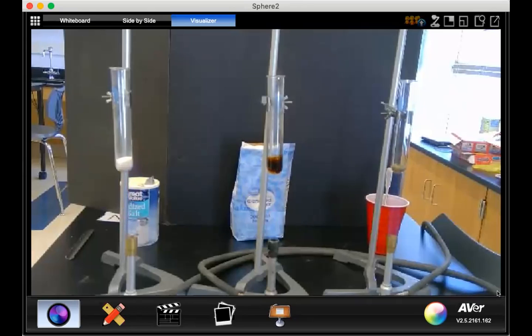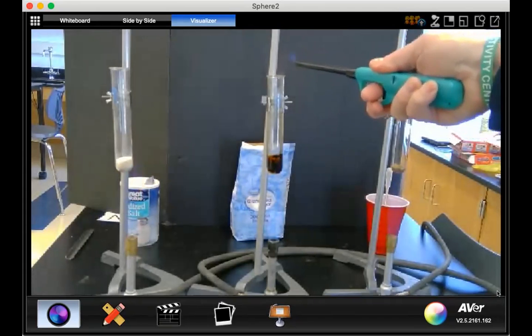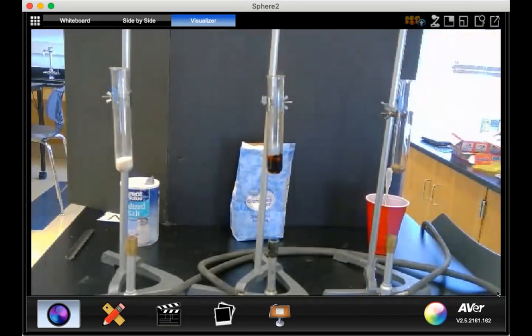From where I'm at, I can see a little bit more as I see some of them start to get a little shiny as they start to melt a little bit. Now you'll notice coming from the sugar, as we get close to the 2 minute mark here, you're going to see those vapors coming out of it, don't you? I'm actually going to try and burn a few of those off because they smell a lot. It doesn't smell bad right now. It's really kind of a caramely smell, but it gets a little strong.